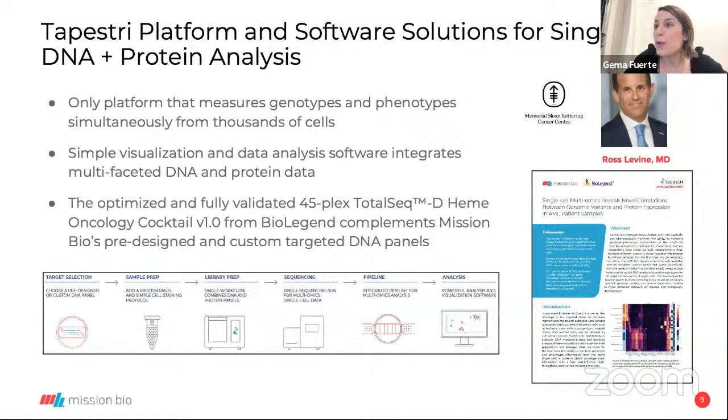So what I want to show you first is a couple of images from this application note, just as a sneak peek of what the software Tapestri Insights and Mosaic can do.